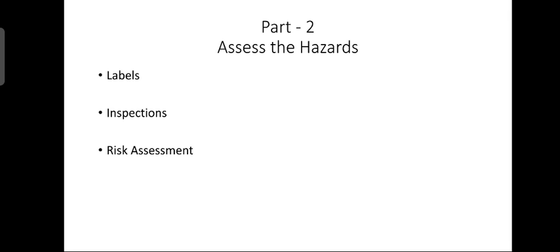Now what is inspection? Conduct a laboratory safety inspection. Identify common safety concerns upon casual examination of a laboratory. Next, let us see what is risk assessment. Explain the process of assessing the risk from chemicals and chemical procedures. Prepare and explain a general risk assessment matrix.